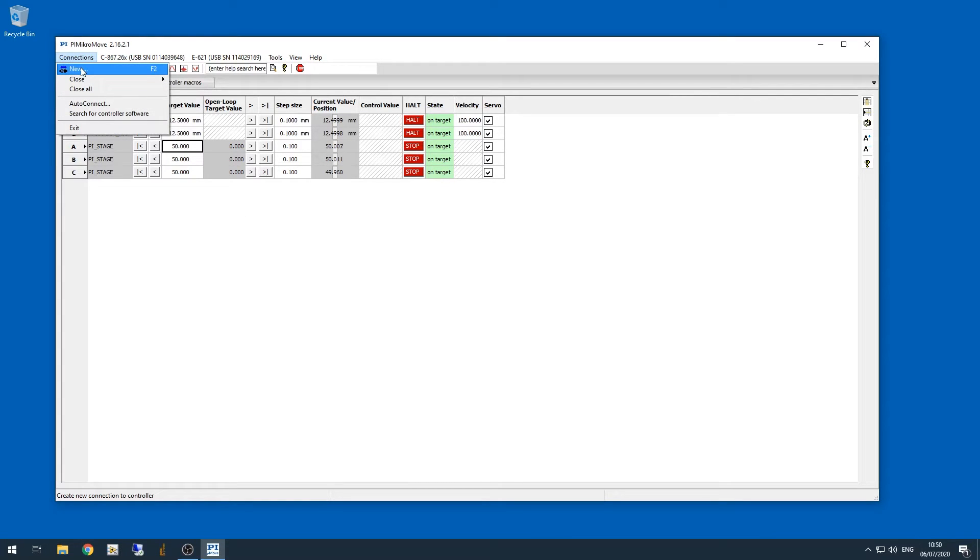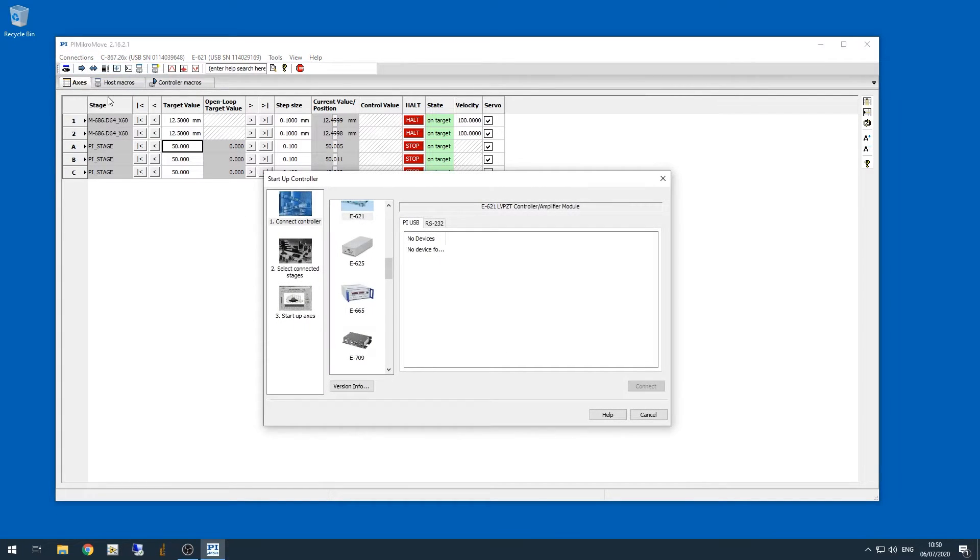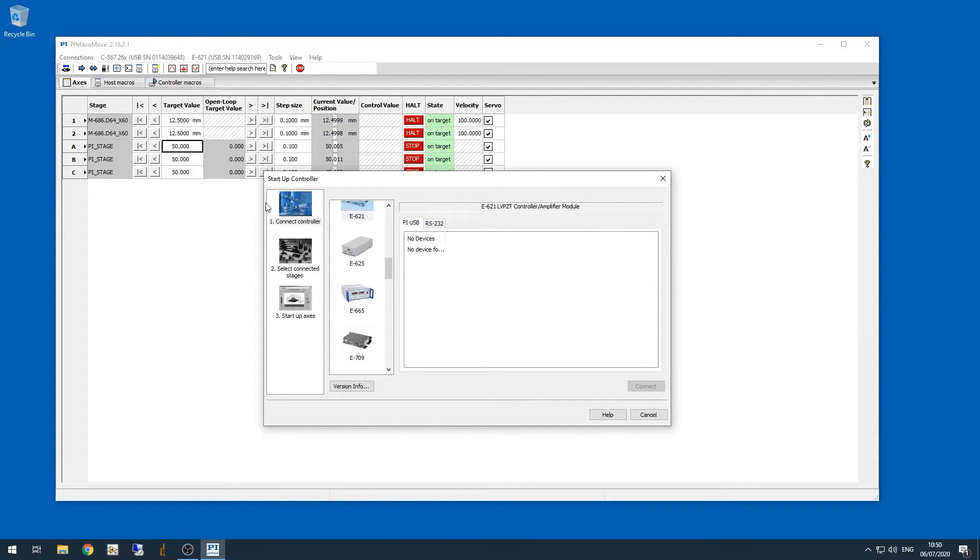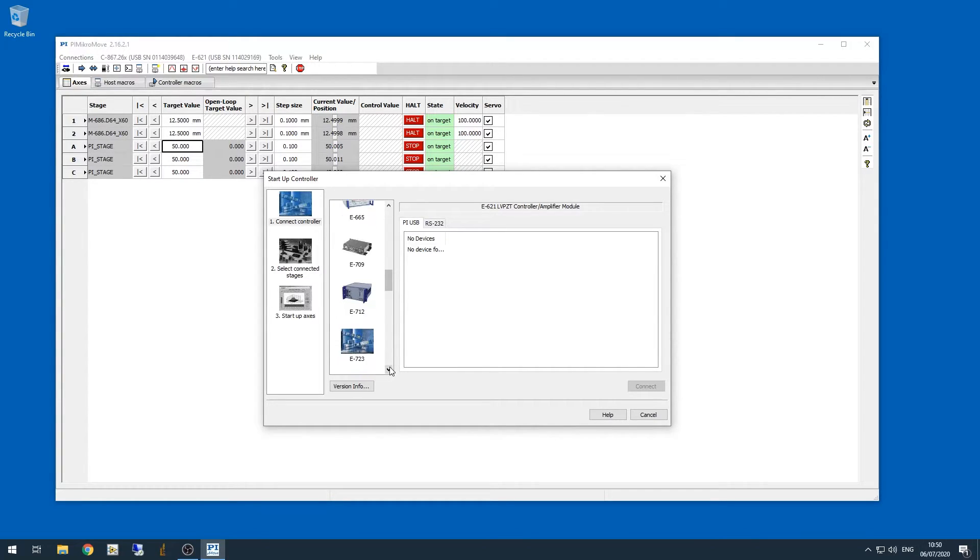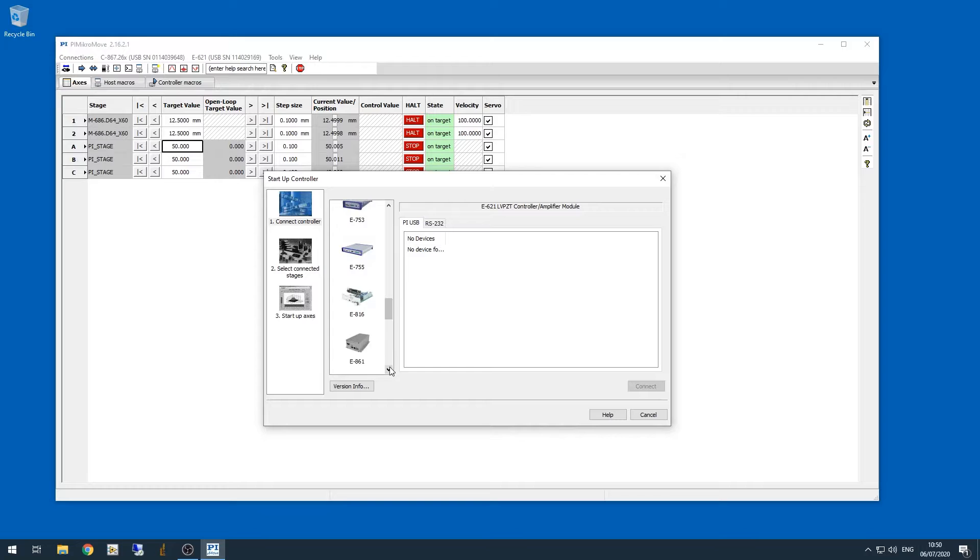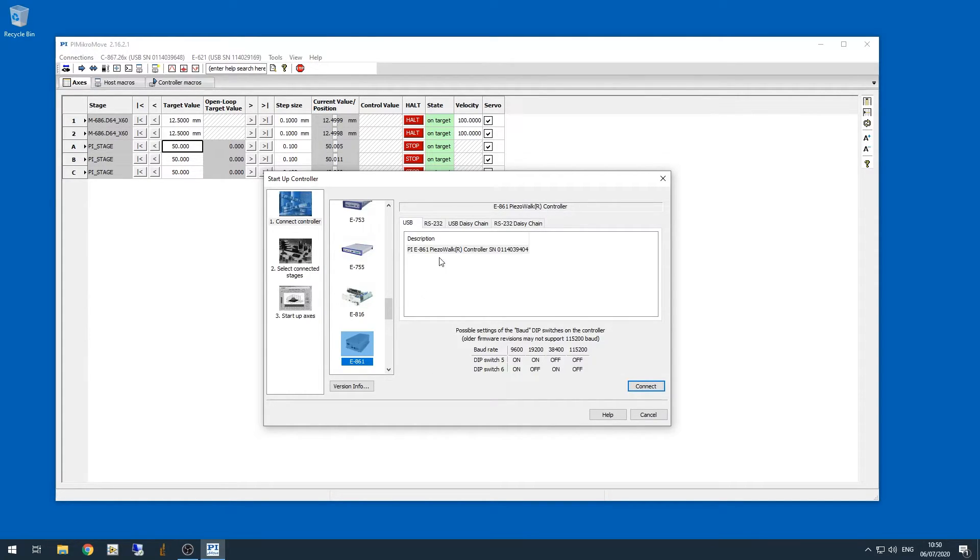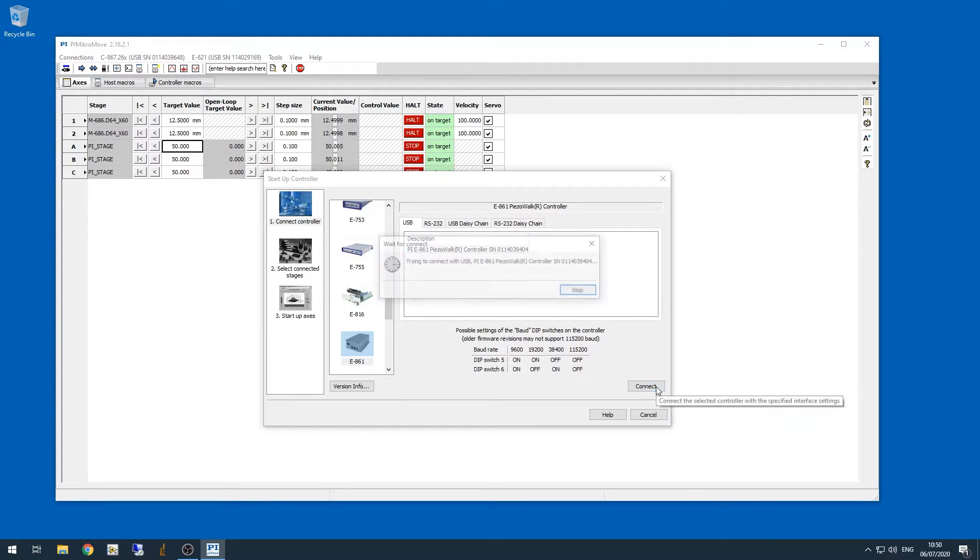Okay, now let's connect with the upper objective Z stage, which is the E861 controller. So we're going to have to look for it in the list of available controllers. There it is, E861. I'm clicking connect.